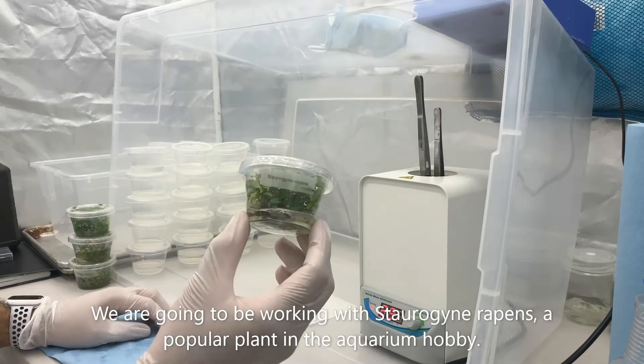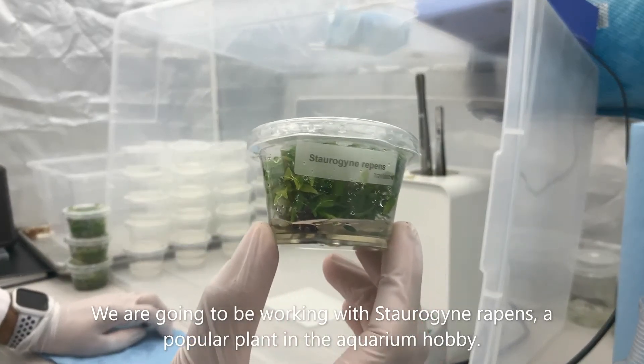So today we're going to be working with Staurogyne repens, a popular plant in the aquarium hobby.